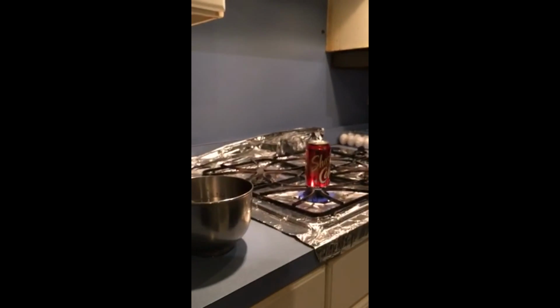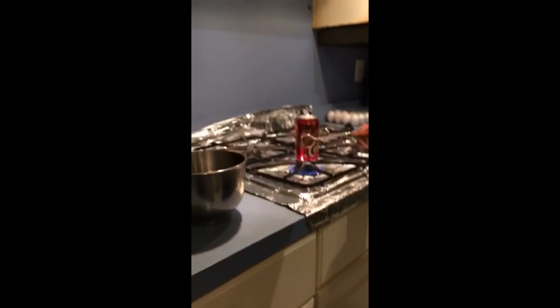Now I will flip this can over and put it upside down into the ice cold water. And when you do this, the can will crush. And now the can has been crushed from air pressure.